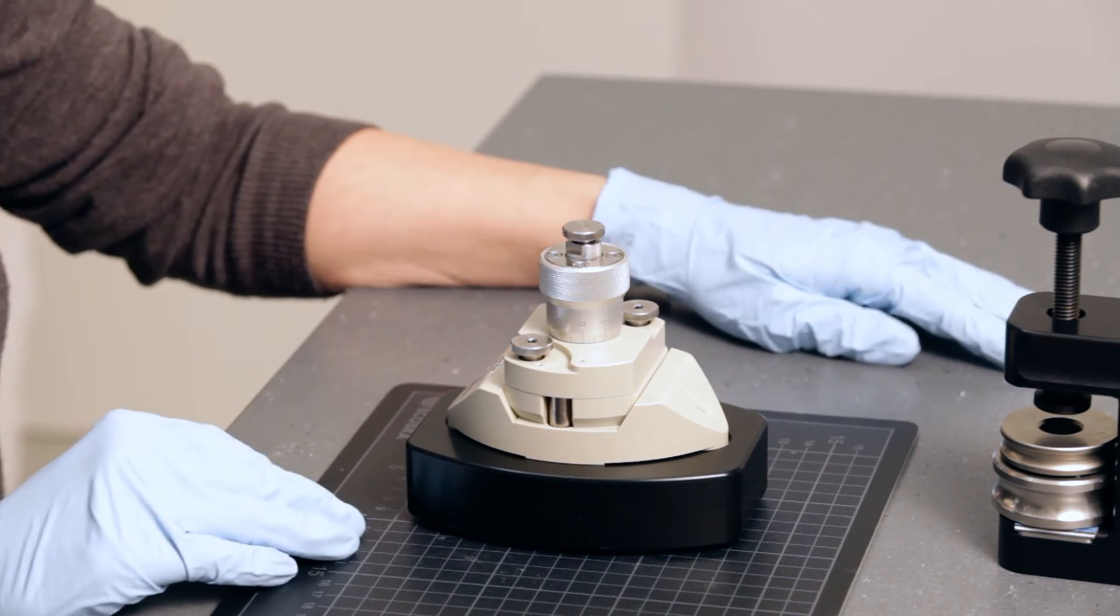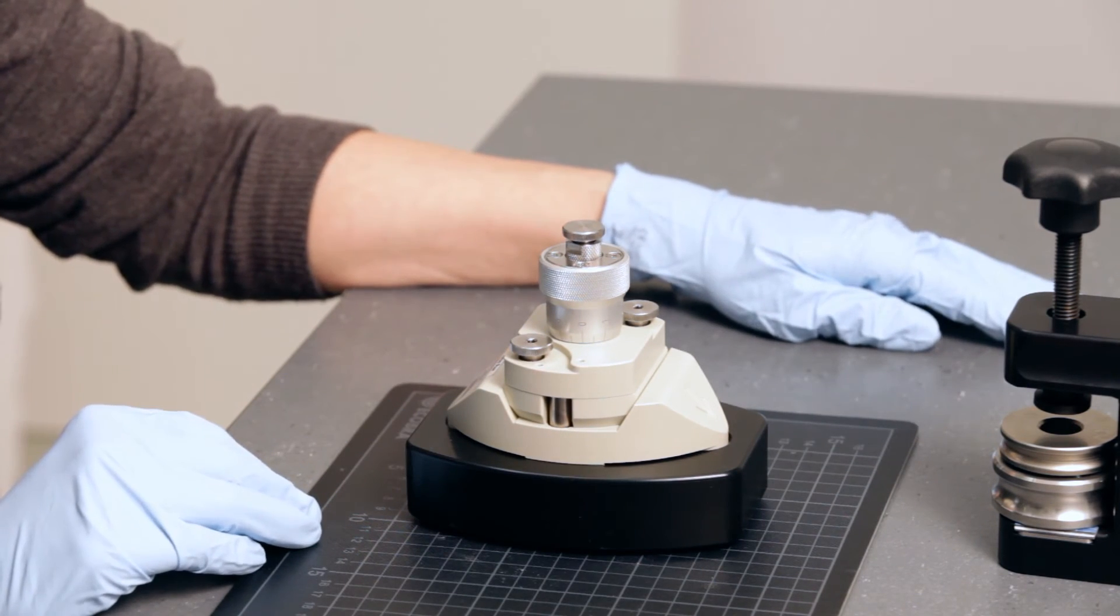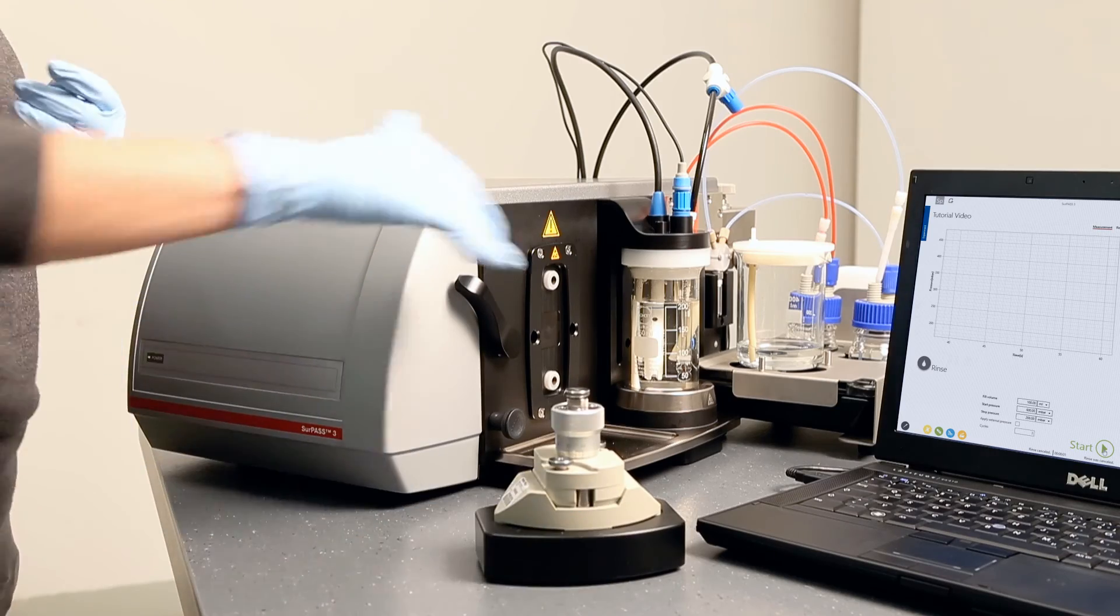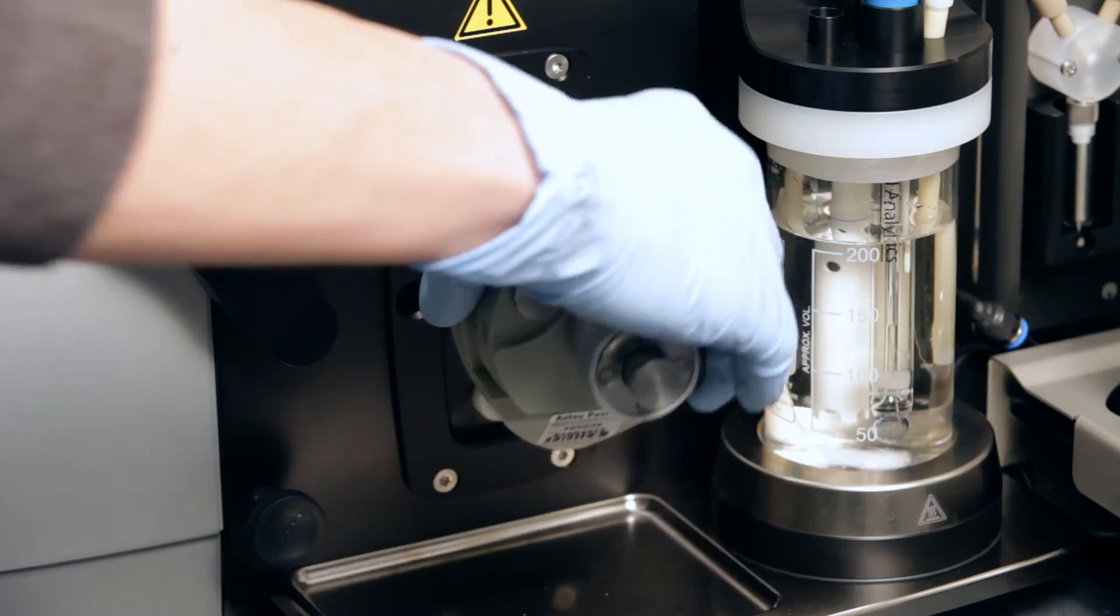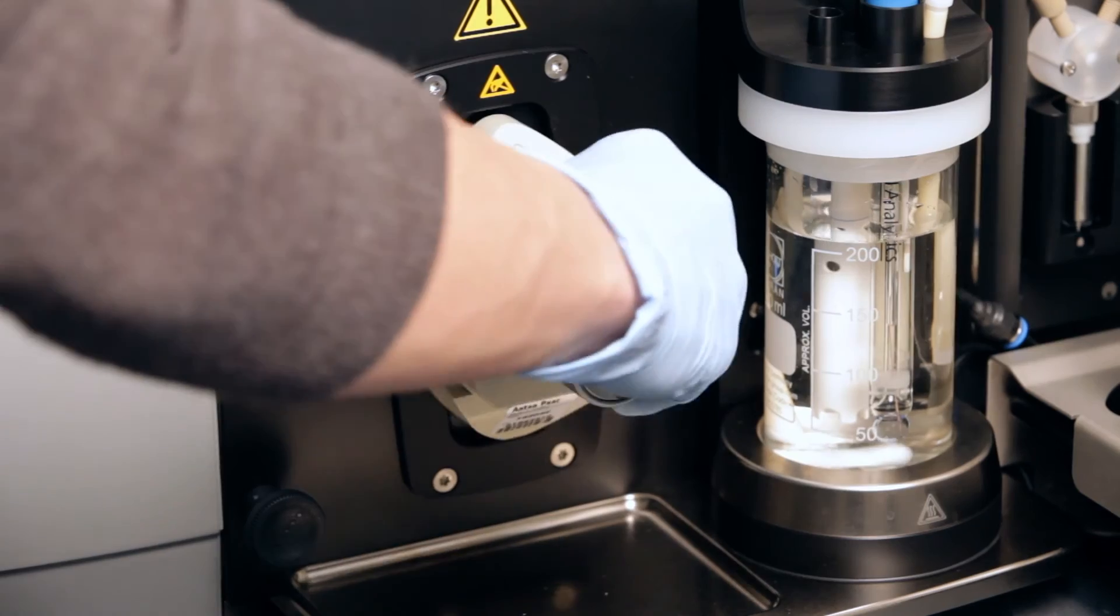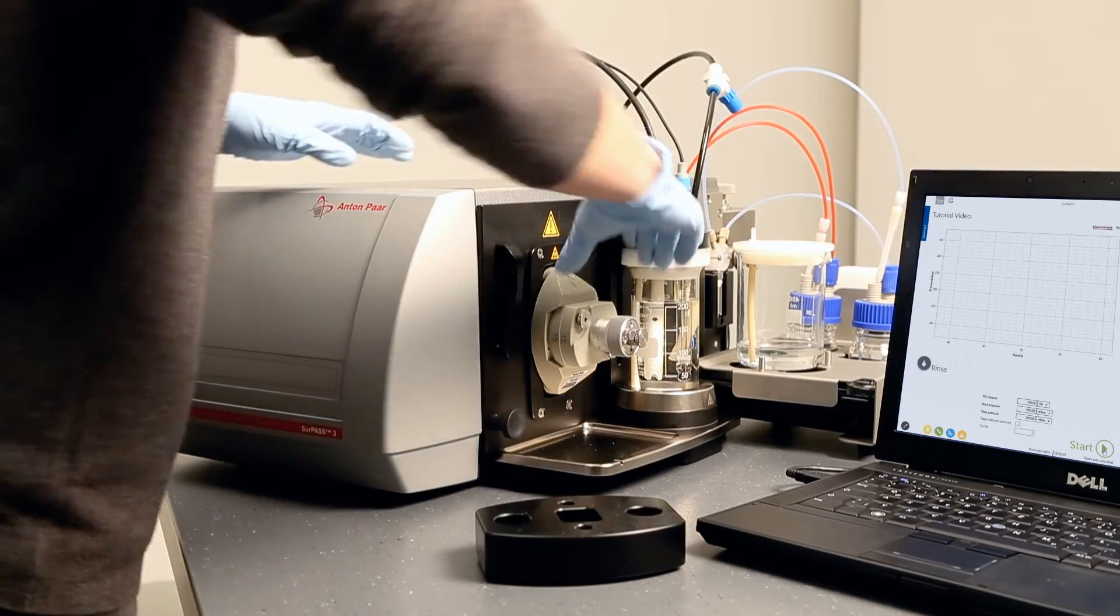Now you can mount the measuring cell on the instrument. Simply plug in the cell and lock it by turning the lever to an upright position.